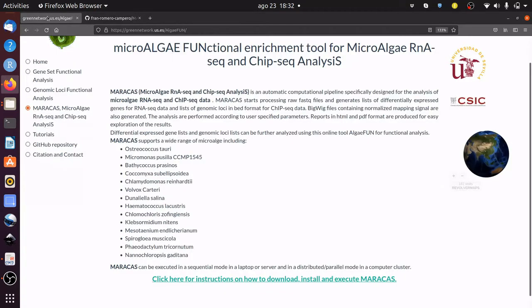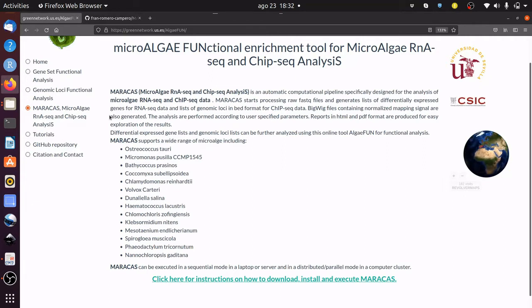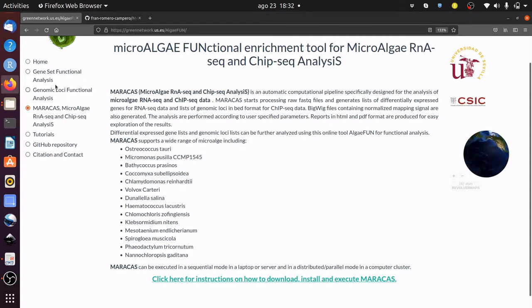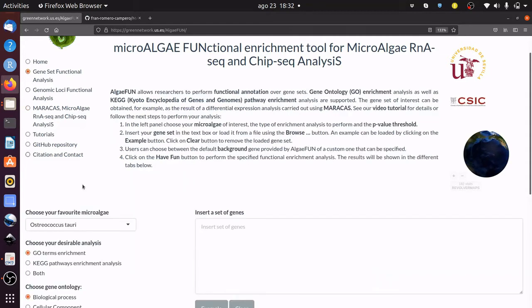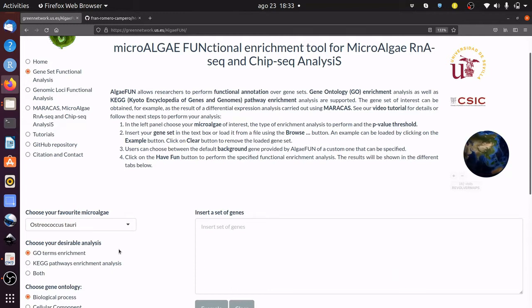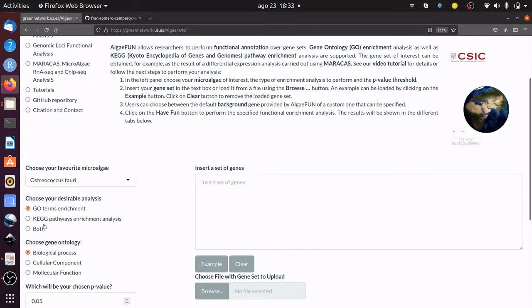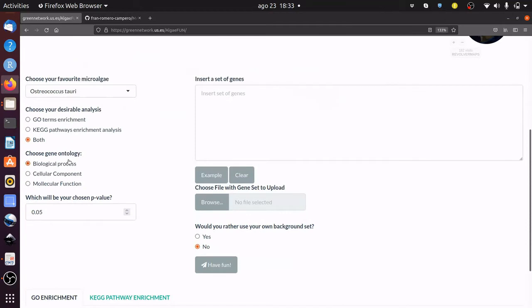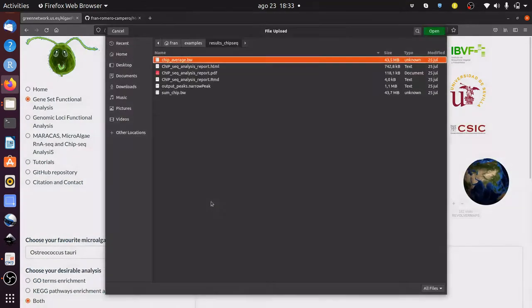Typically, functional enrichment analyses need to be performed over a set of differentially expressed genes. Our online tool, AlgaeFan, supports this type of analysis. You need to select your microalgae of interest—Osteococcus tauri in our case. Choose if you want to carry out a GO term enrichment, a KEGG pathway enrichment analysis, or both. Choose the gene ontology and the p-value threshold. The gene set to be analyzed can be inputted in this text box or uploaded from a text file using this button.